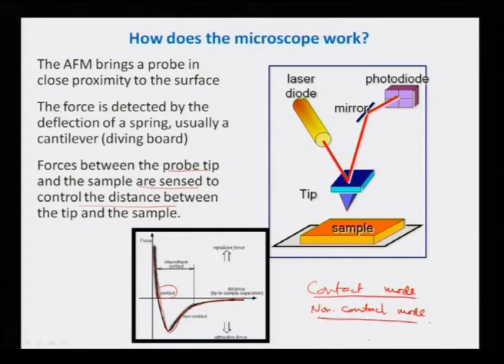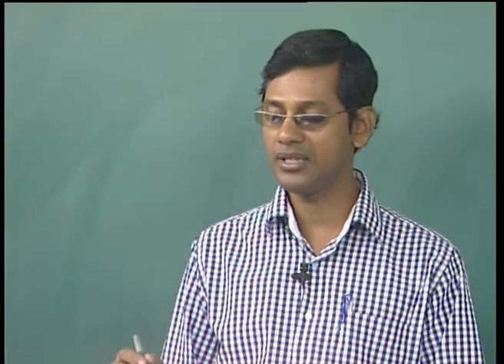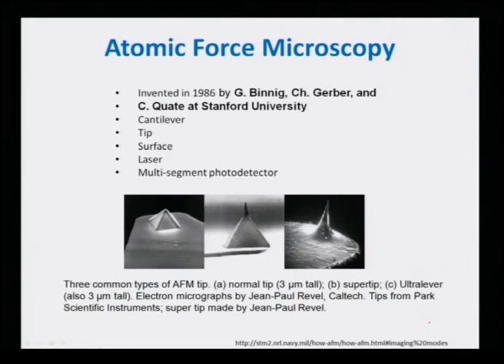We will discuss contact mode and non-contact mode one by one, but I hope you have understood the basic mechanism. The basic mechanism is the forces between the atoms of the surface and the atoms of the tip. So, those are the probes. Now, before that, let me just tell you how it came about. It was again discovered by Binnig, Gerber and Quate at Stanford.